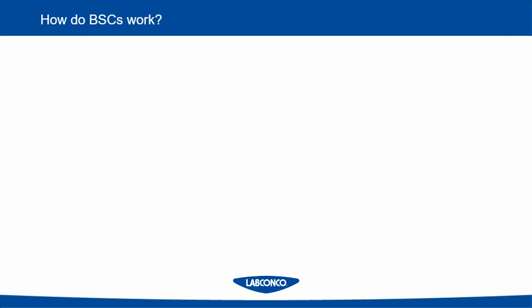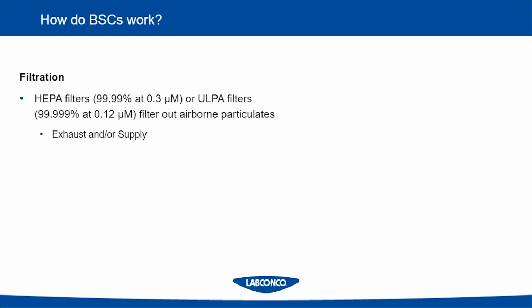So overall, how does a biosafety cabinet work? First, the first thing a biosafety cabinet always has, just as I mentioned earlier, that a fume hood does not have, is some sort of filtration. HEPA filters or ULPA filters are commonly used to filter out the viruses, the bacteria, or particles that you may be working with.